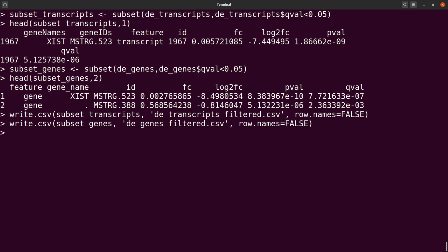Now let me show you how you can also extract the read counts and then save them to an output file. We are going to extract the read count for both the transcripts and then the genes. So let's start with the transcripts. So we say fpkm. We are extracting the fpkm, by the way. And then let me say underscore transcripts. We want that for transcripts. So this variable here will contain that information. So we say texpr, and then we specify the Ballgown object, the filtered one.